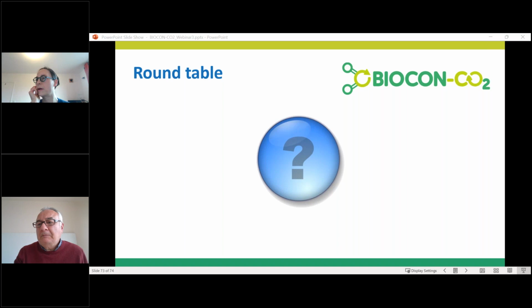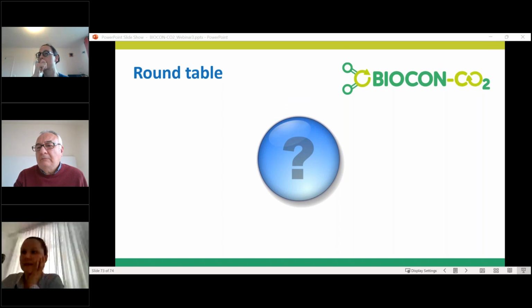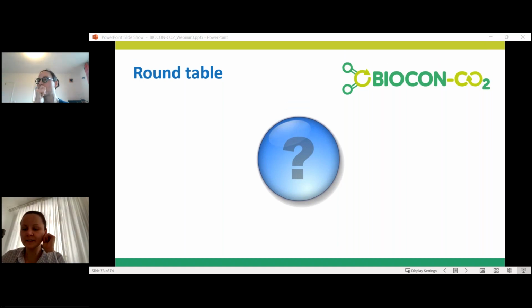Okay, and I see a last question. Which type of CO2 sensor was used? So this is an infrared NDIR-based sensor made by Dynament, I guess. They're quite small, and based on an infrared spectroscopy measurement inside the sensor. If you want a link, please email me. I'm happy to give you some more information about the sensors. So Dynament it is.